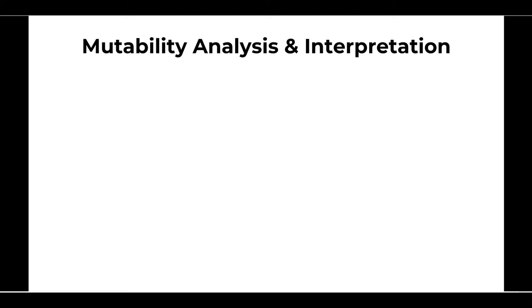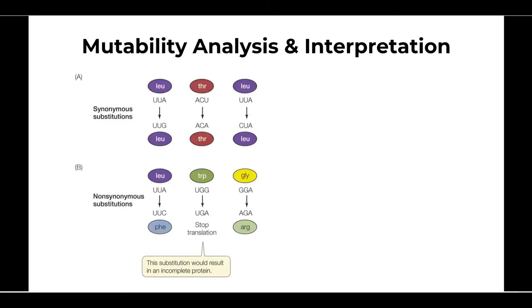Today we are going to discuss mutability data analysis and then get hands-on practice on the T-Bioinfo Server for the same. So what is mutability? Mutability in simple terms describes the observed rate of a given position to change or mutate.